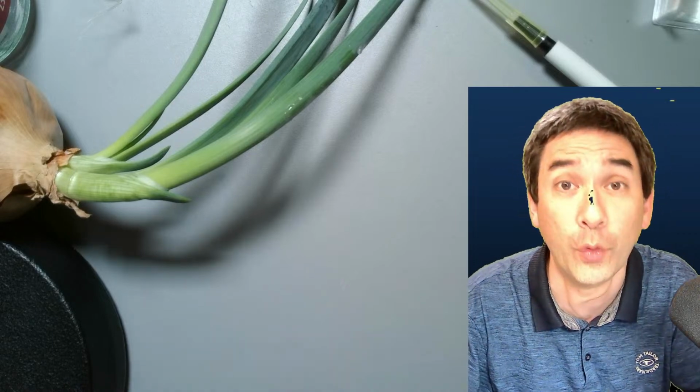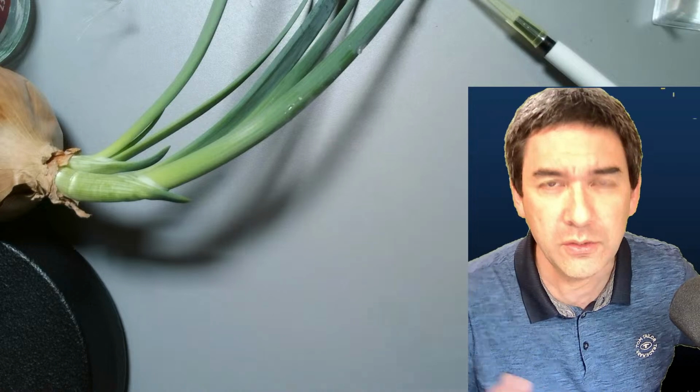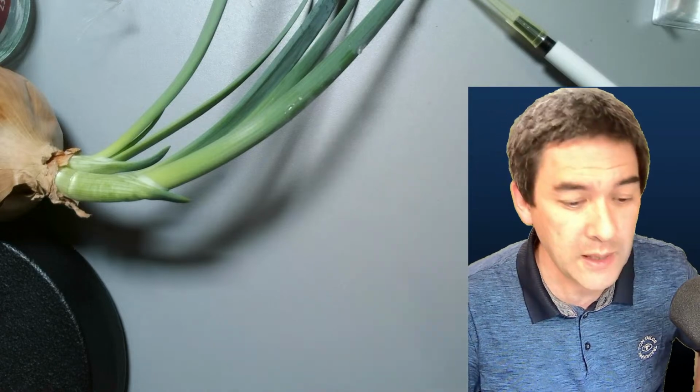Which model of an Olympus microscope? My first Olympus microscope of almost 30 years ago was a CH40, and right now I've got a BX53. You can Google it. So I'm gonna move on.